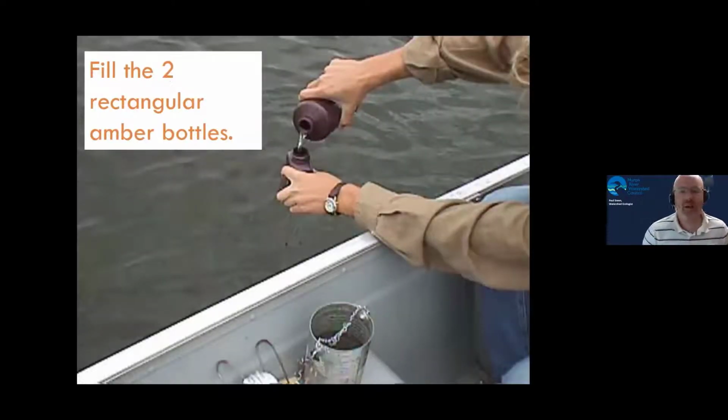With your amber bottles in hand, you'll have 2 of those, remember. You are going to fill those up. And then you'll be mostly done on the water.